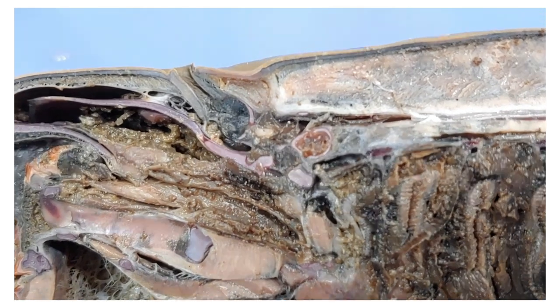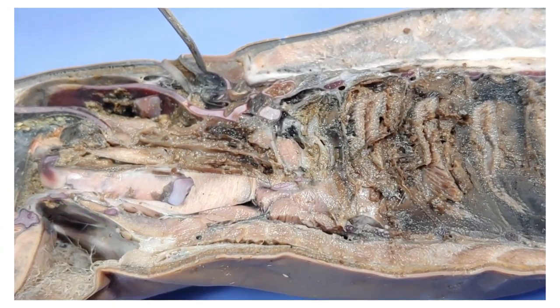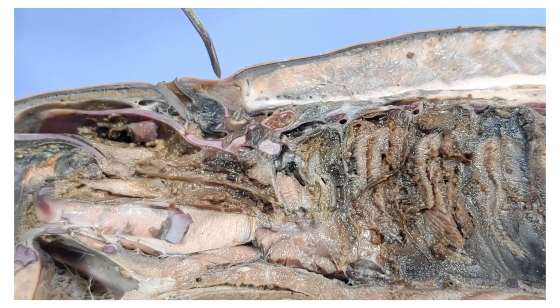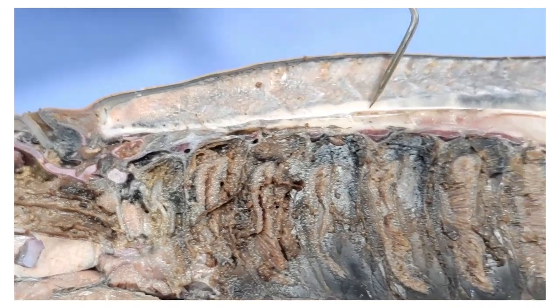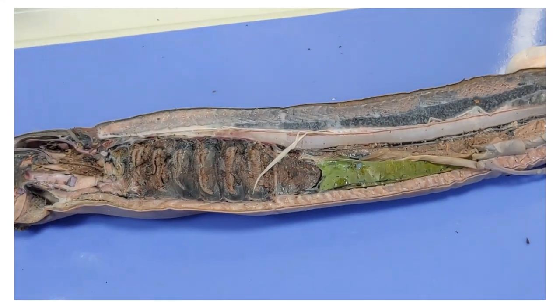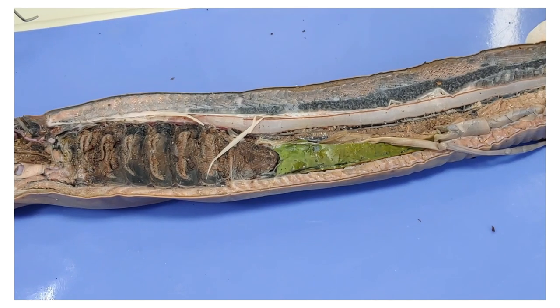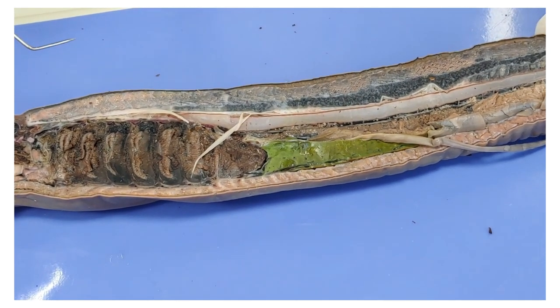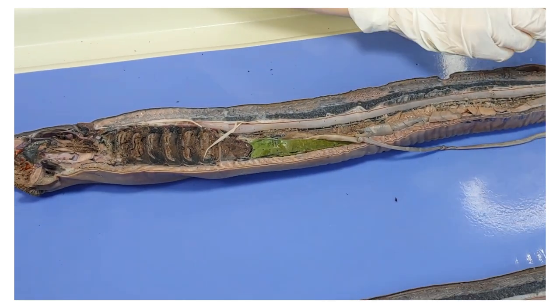Now we'll move up to the head of the lamprey. Here's the nostril we saw before, and the structure it opens up to is called the olfactory bulb — the lamprey uses this to smell. Right behind the olfactory bulb, this triangular structure here, is the brain of the lamprey. The brain connects to the spinal cord, which runs down the back of the lamprey. While the lamprey is a vertebrate, it is one of the most primitive and doesn't have true vertebrae. Instead, it has a series of cartilaginous structures that provide support — this is called the notochord, and it lends flexible support to the lamprey's body, running all the way down.